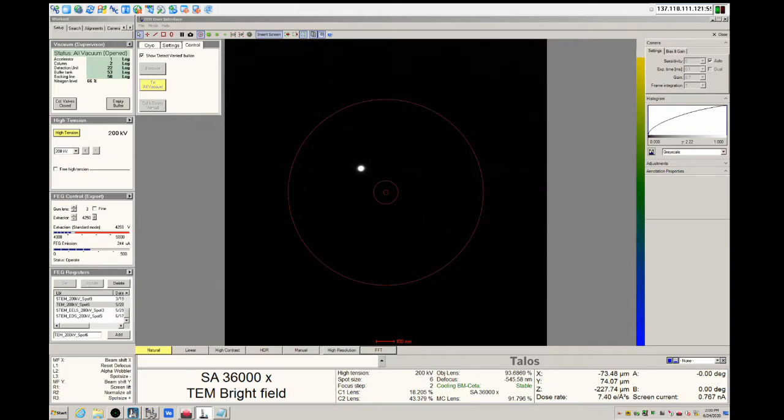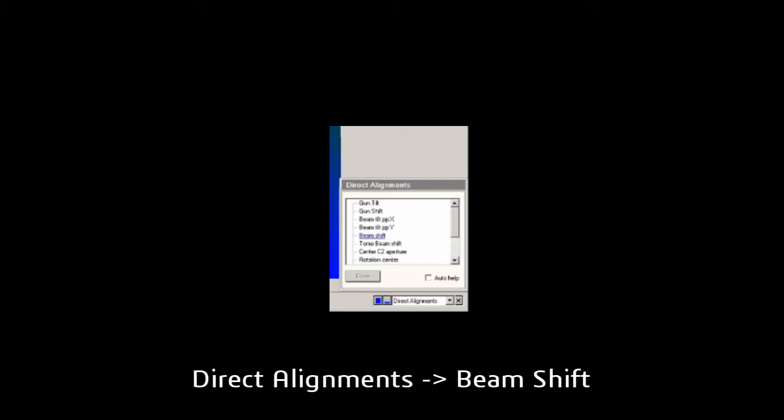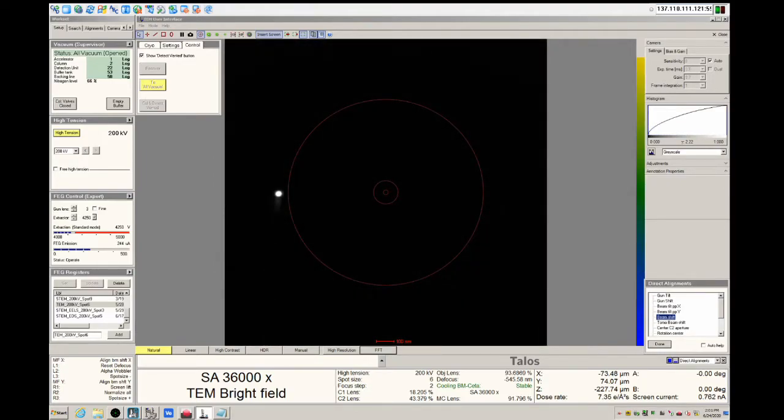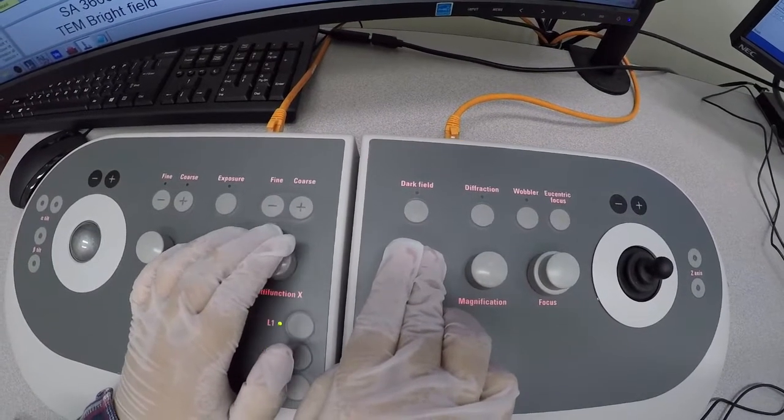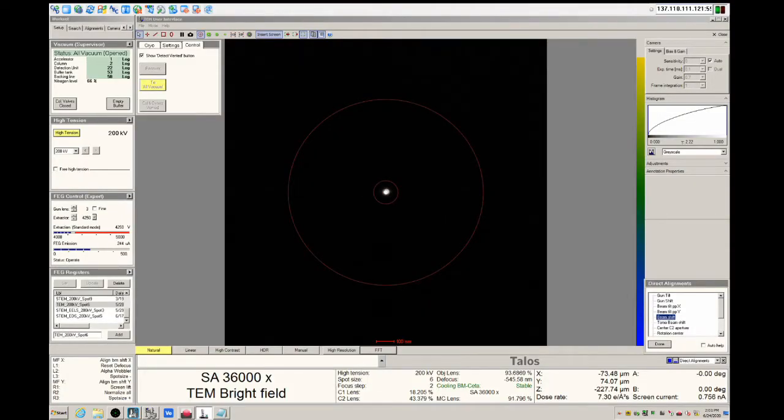Many of the alignments are accessed from the bottom right of the screen. The first alignment will be direct alignments, beam shift. The goal of this alignment is to move the spot into the center of the screen as indicated by the circle fiducial. For almost all alignments, you must use the multifunction X and multifunction Y dials. Take care not to accidentally move the stage with the joystick or otherwise. When complete, click done.